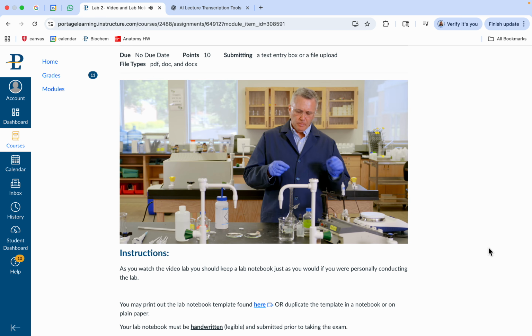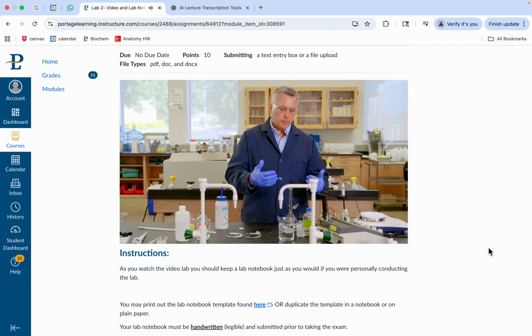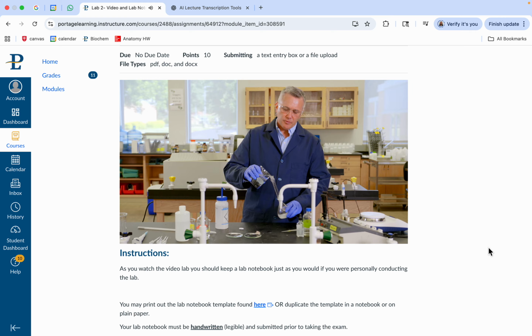We're going to use a pH probe, and we want to leave a little bit of room because the pH usually isn't the exact number. In this case, it's going to be 7. So we want to make sure that we leave a little room to adjust it with acid or base to the correct and desired pH. We should be close, but sometimes they can be off. So we're going to add a little bit of water.